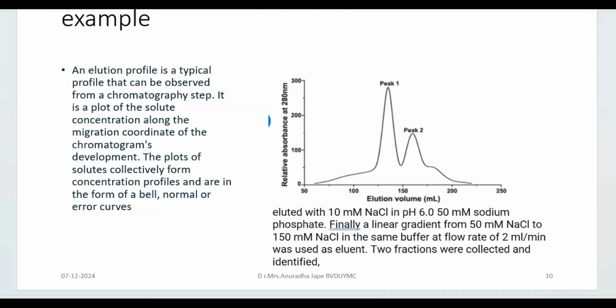So it will give you an idea whether it is appearing in fraction 1, appearing in fraction 2, at what time interval, and so on and so forth. But this is to automate or convert into graphical presentation.